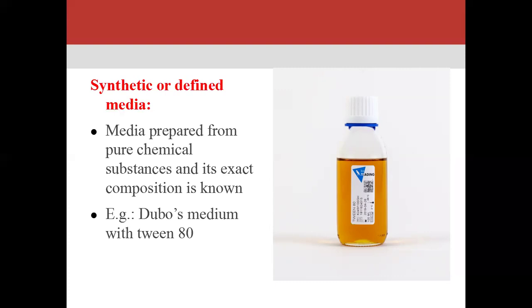So what is the purpose of synthetic media? It helps for special studies such as metabolic requirements. The best example is Dubos medium with Tween 80. Dubos medium with Tween 80 is the example for synthetic or defined media. This is helpful for isolation and growth of Mycobacterium tuberculosis.